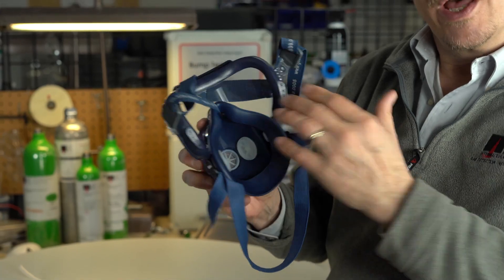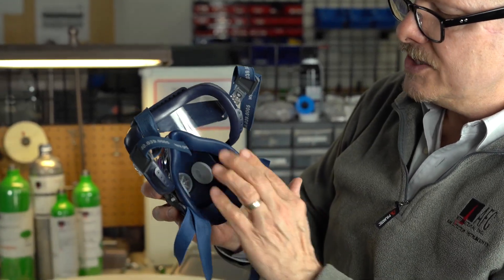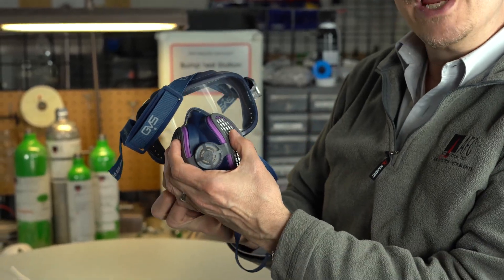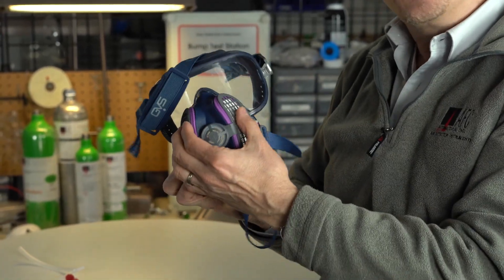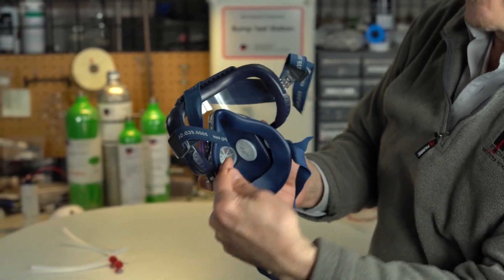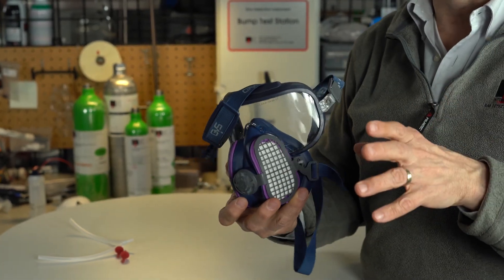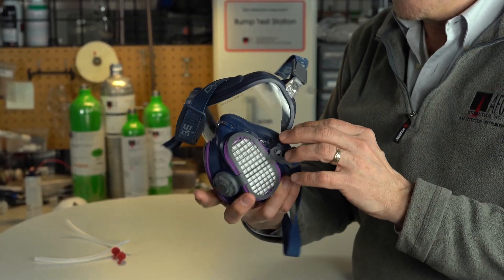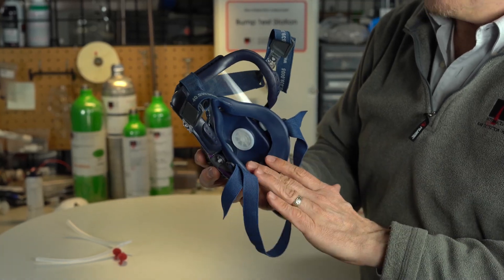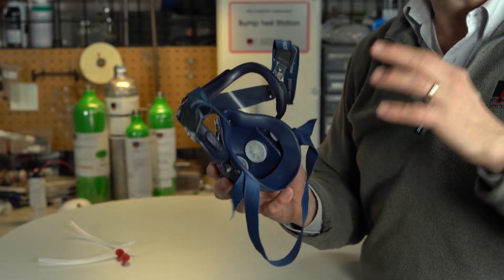Why do we do fit tests on these? Because when we create that negative pressure, we want to make sure that the sealing edge is tight on your face so that it forces the air you're breathing from out here in through these filters. If we didn't have a good sealing edge, it could come around and bypass the filters. So it's really critical when you use a half or full-face mask — and even your disposable N95 and P100s — to be fit tested if possible.